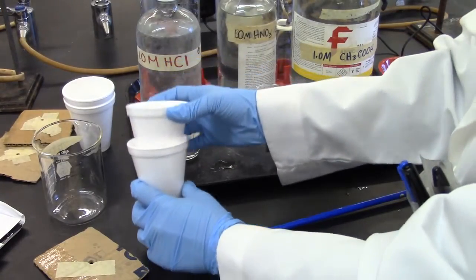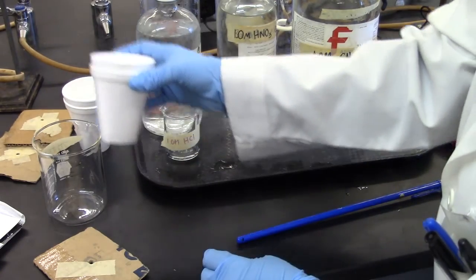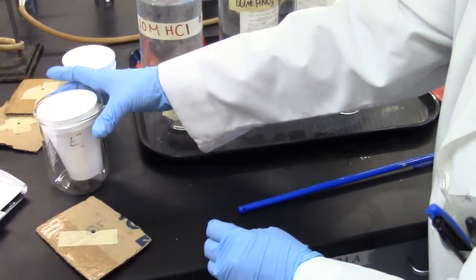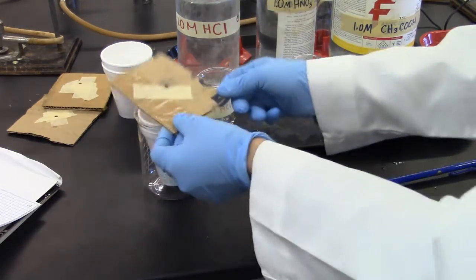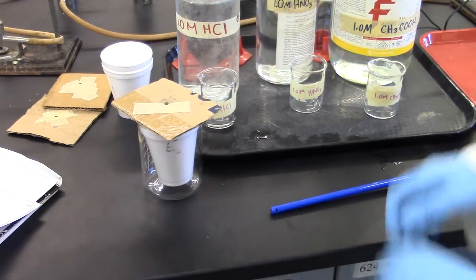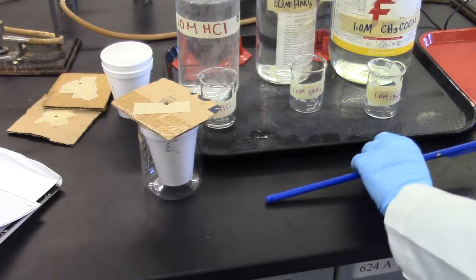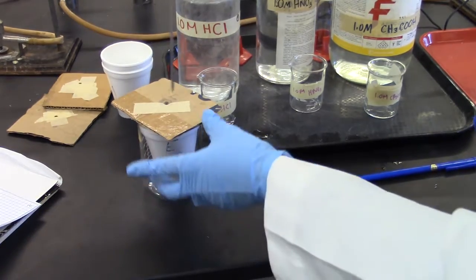The calorimeter consists of two styrofoam cups which will be placed in a beaker for stability and will be covered once the reaction is mixed.